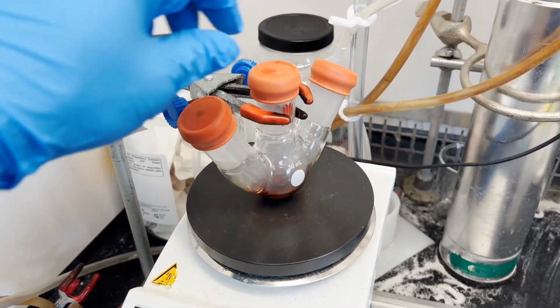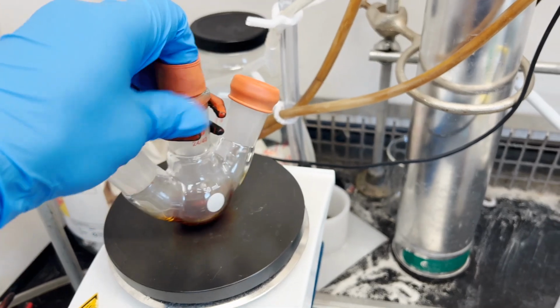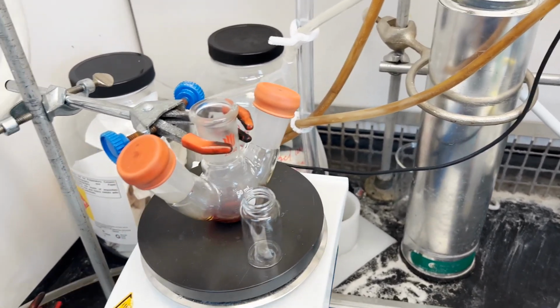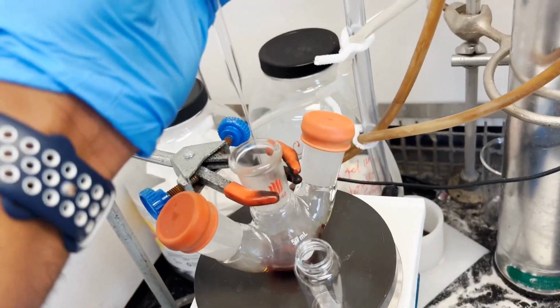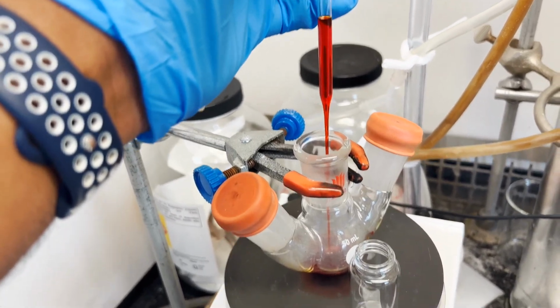Then you can transfer that liquid into a vial or another round bottom flask to do the rotovap. Here I am transferring the liquid into a clean, dry vial so that there is no water, otherwise your compound will break down.